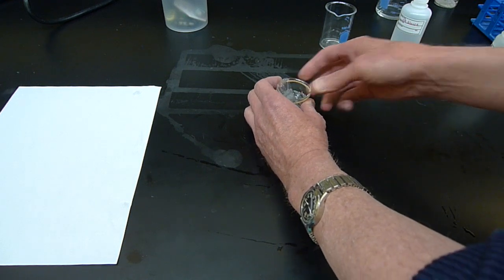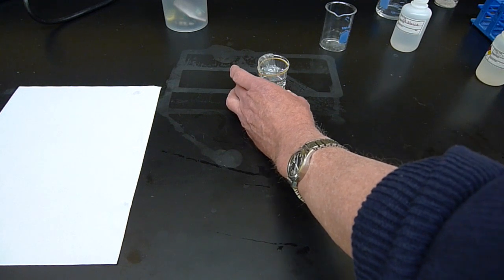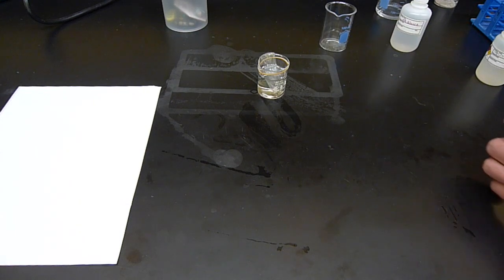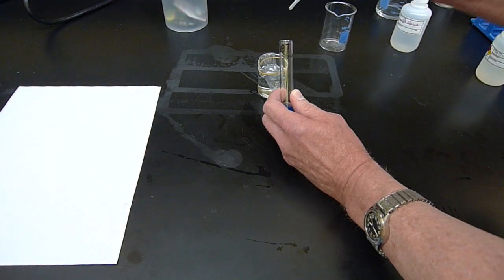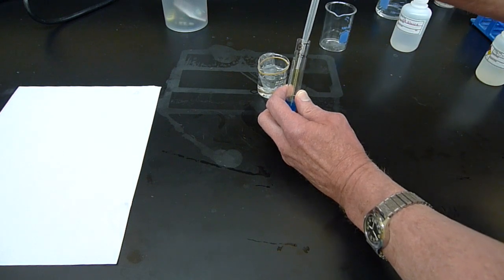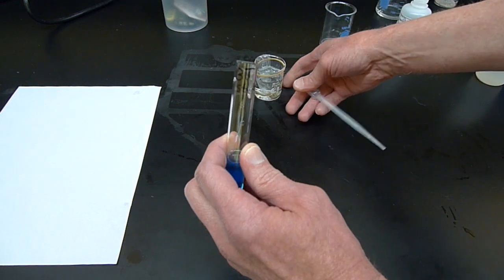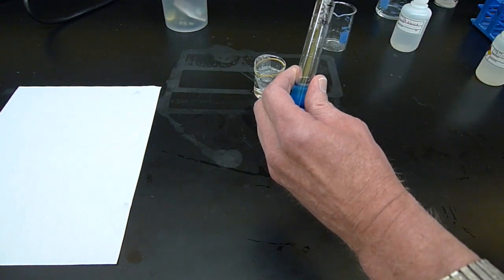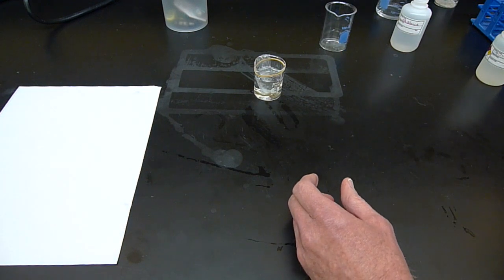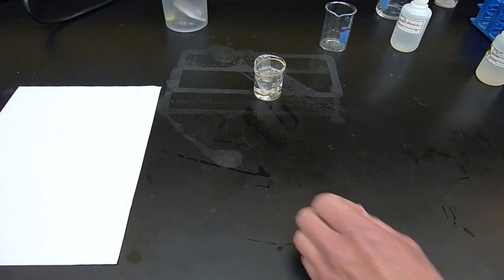I'm going to time this. I'll put on a timer. It's going to sit for probably 15 minutes or so. The time is not crucial. But in the meantime, before this gets very going, I'm going to take some of the solution of the beaker out, and I'm going to put it into this test tube that says Benedict's test at the start. So that's our sample of the beaker water here before much diffusion happens. And we'll just see what happens at the end of this time period.